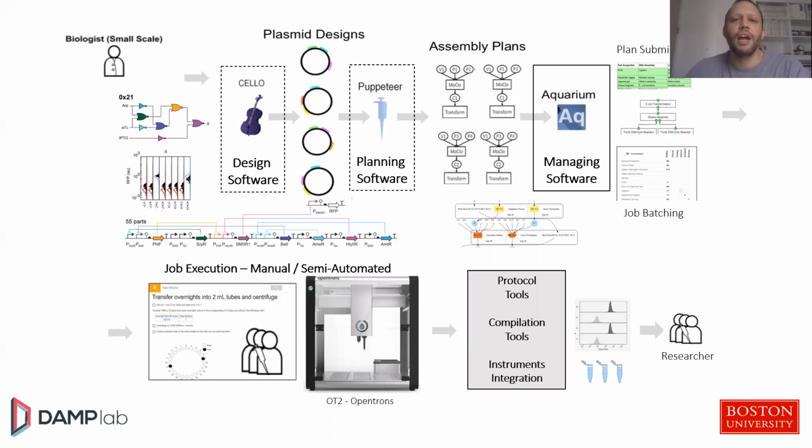One is an automated set of instructions for liquid handling robots. The other could be a collection of protocols created in the environment called Aquarium from the University of Washington, where manual steps can be carried out in a very replicable, standardized way by human technicians. So technicians either go through a series of steps or liquid handling robotics do.